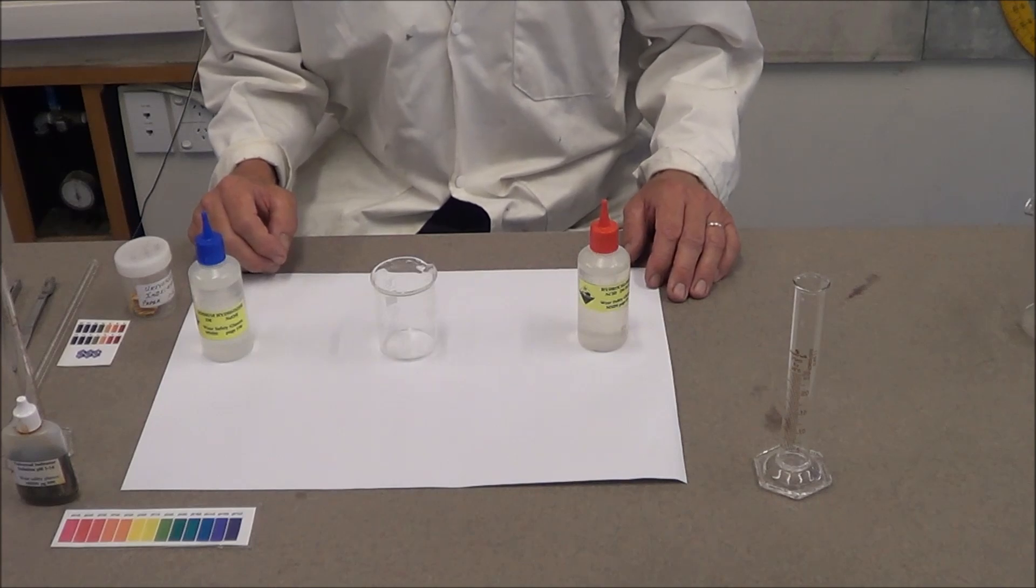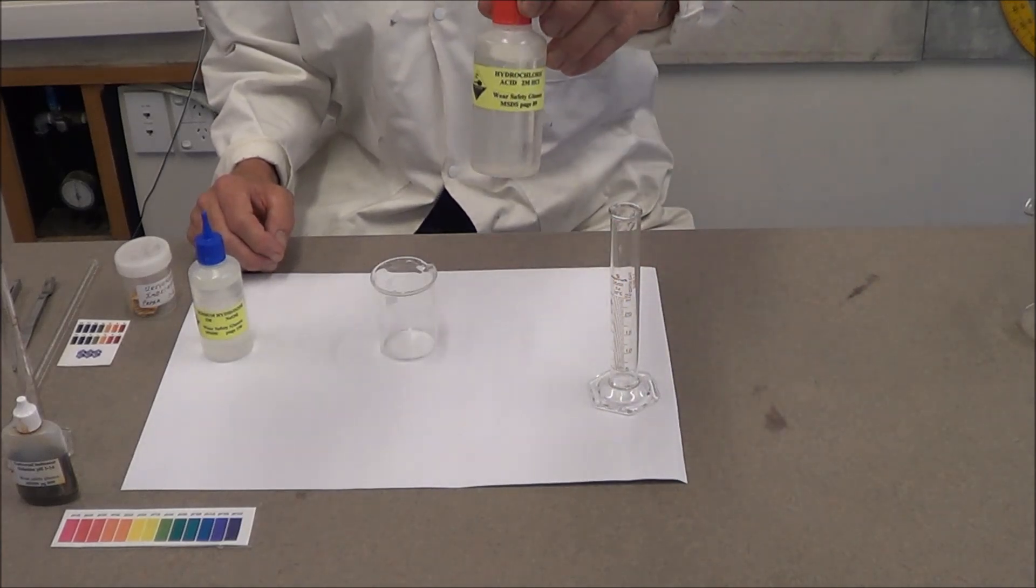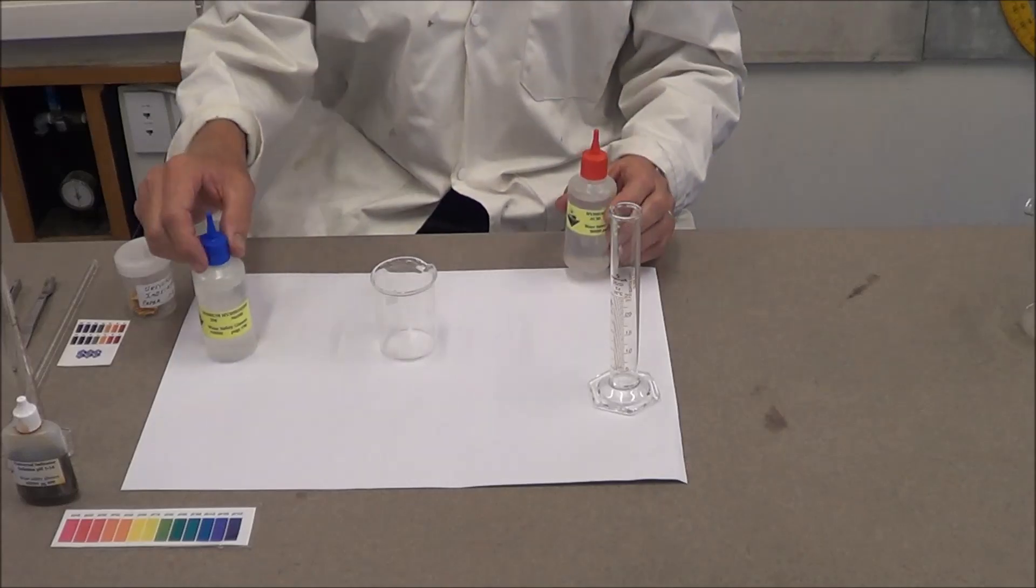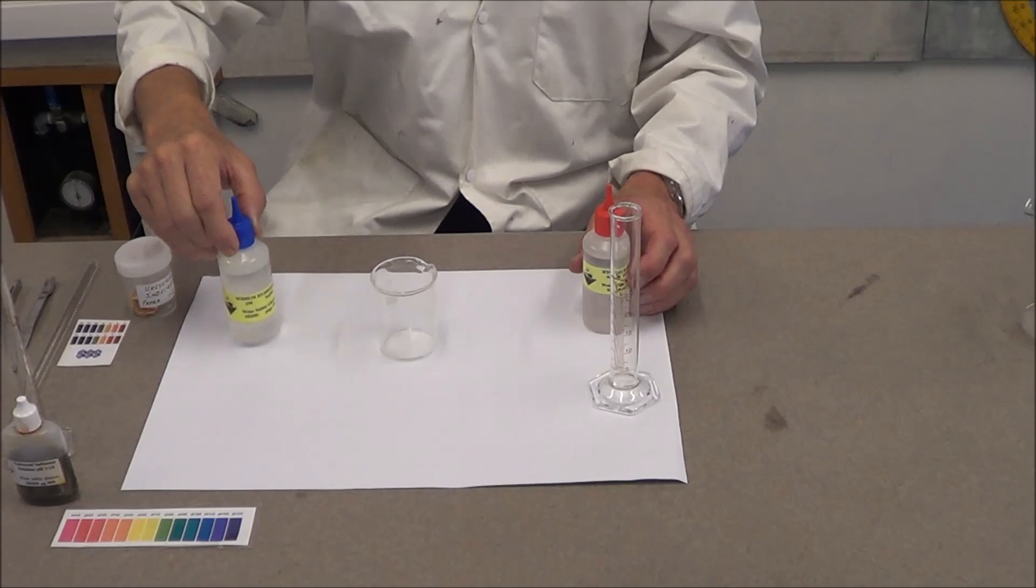We are going to neutralize 20 mL of hydrochloric acid using sodium hydroxide at both the same strength, 2 moles per litre.